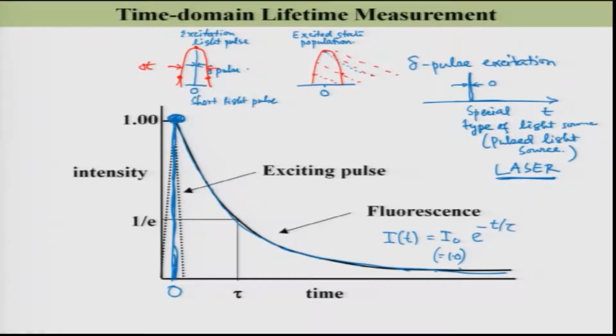So, if I fit this measured fluorescence intensity as a function of time with such an equation, then simply I will get this value, because this t is my variable. So, I will get this tau, or I can say that when the population decay is about 63%, then whatever the time, I can denote it as my tau, the fluorescence lifetime.